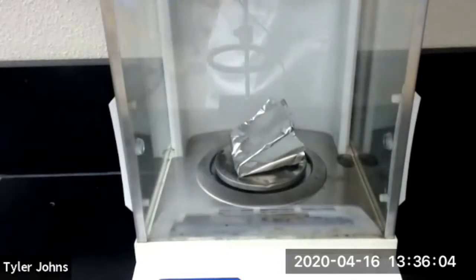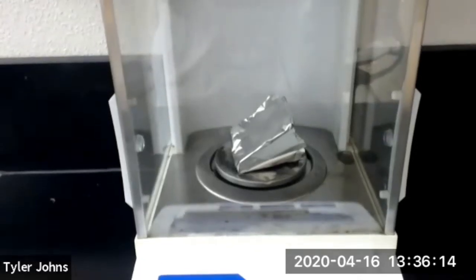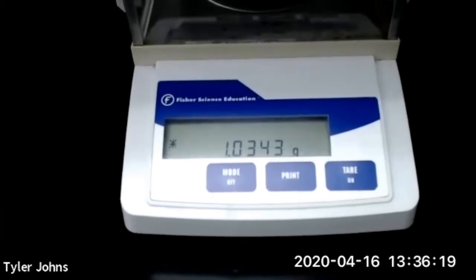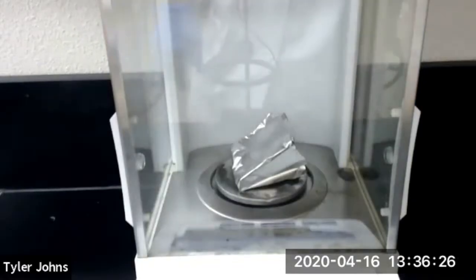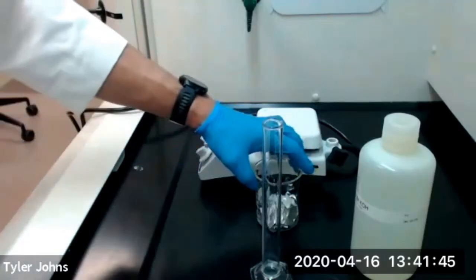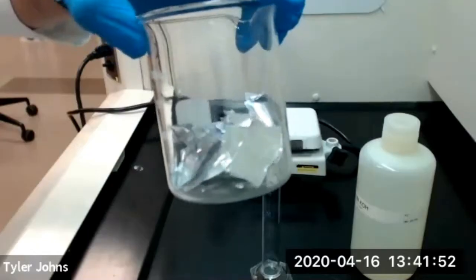Okay, so the first thing we're going to do in this experiment is weigh out approximately 1 gram of aluminum foil. So we have our aluminum foil on the scale right here, and the mass of our aluminum foil is 1.0343 grams. Okay, so I've gone ahead and taken our aluminum foil, cut it up into small pieces, and transferred it to a 250 ml beaker.